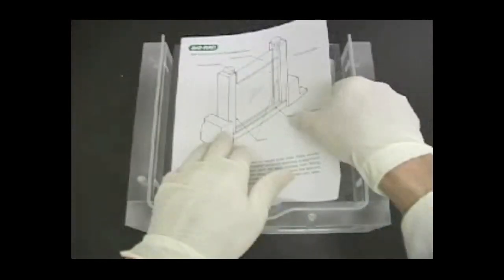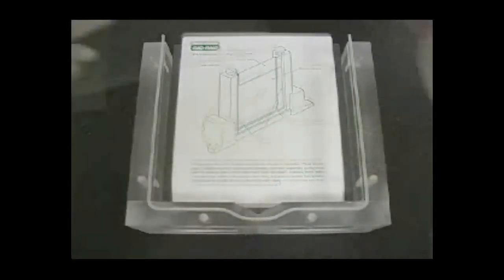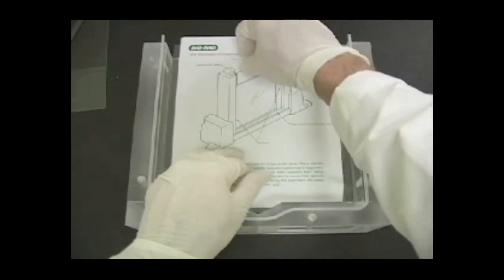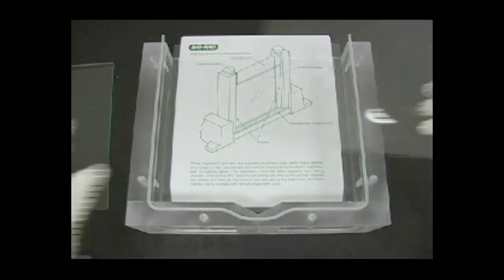Insert an alignment card between the spacers. Place a short inner plate on top of the spacers, then place a separation sheet on top of the short plate.